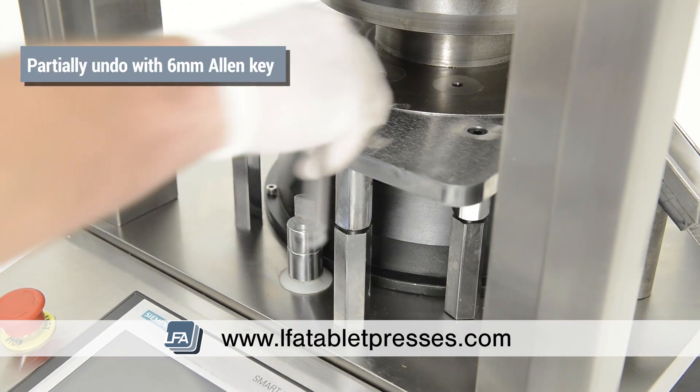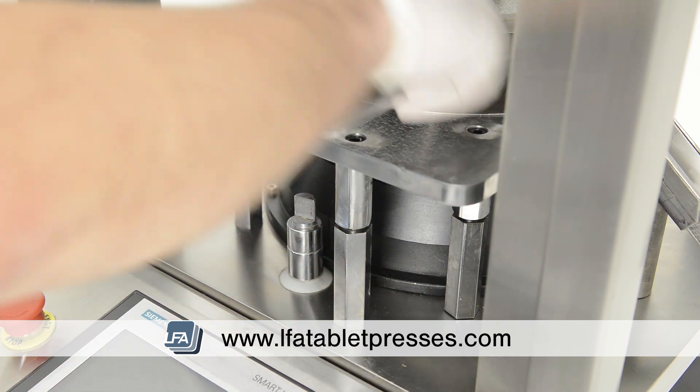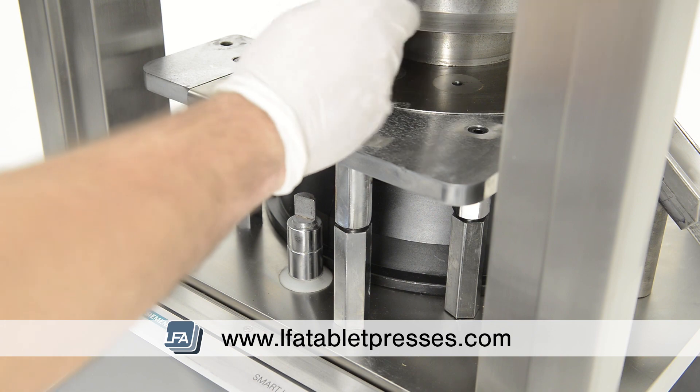Partially undo the three bolts on top of the force feeder plate using a 6mm Allen key, but don't remove them completely, as this is going to allow us to make adjustments to the force feeder plate.